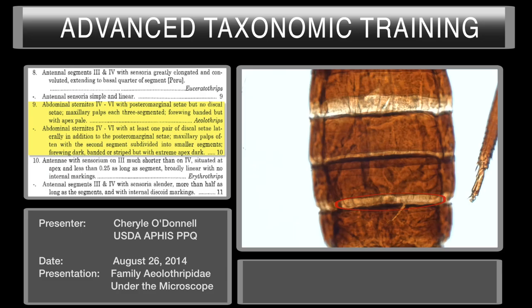The sternites will have marginal setae but no discal setae, and you can see that here — there are marginal setae but no discal setae. Marginal setae here, no discal setae. So this falls into the genus Aeolothrips.